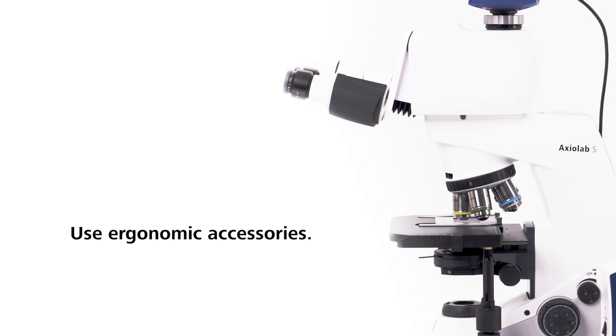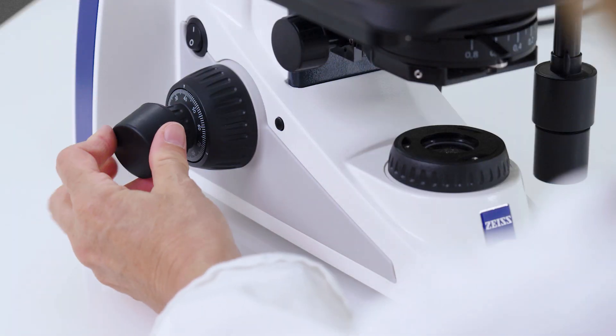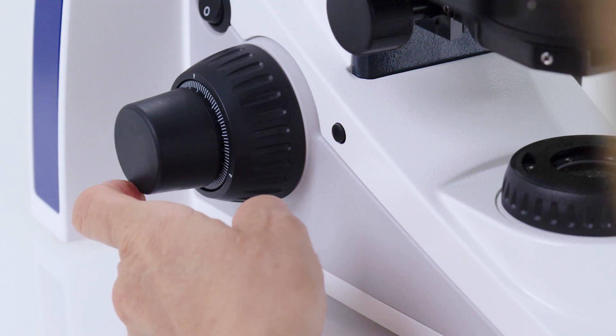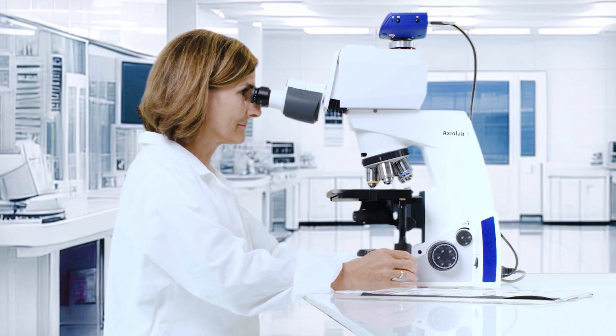Use ergonomic accessories like a rubber cup on the fine focus control to reduce hand strain. This can make a big difference during long microscopy sessions.